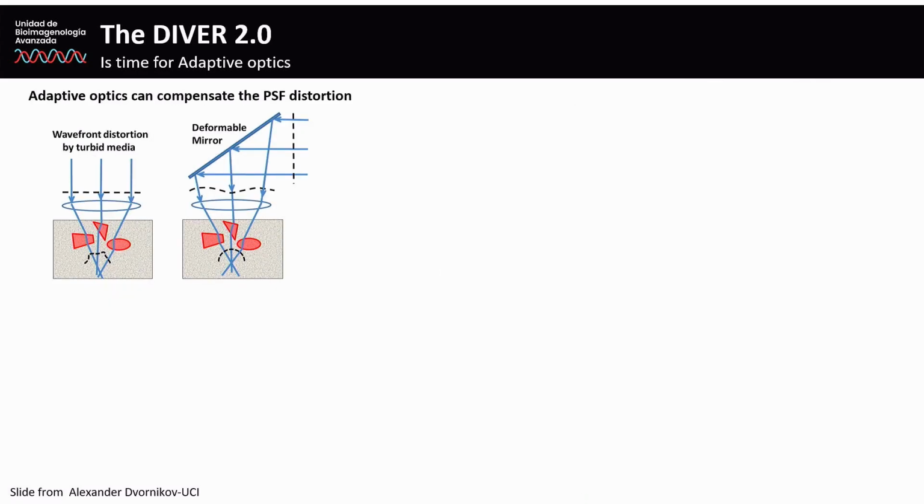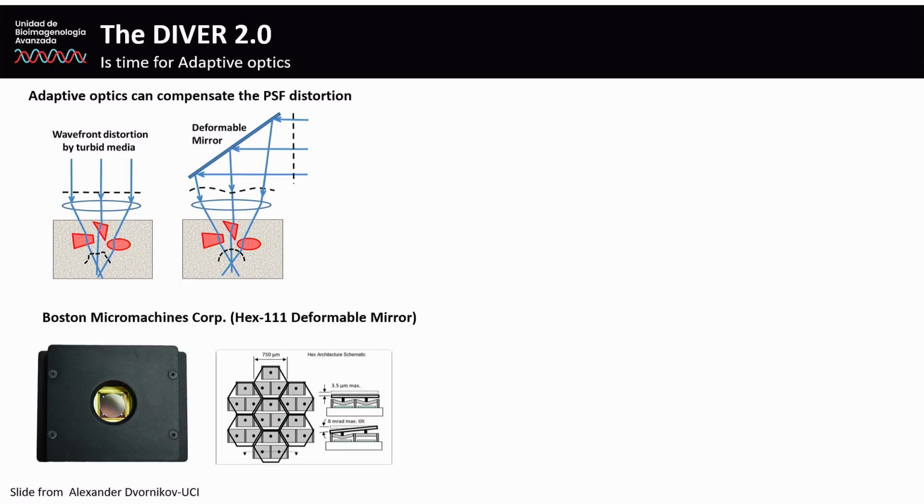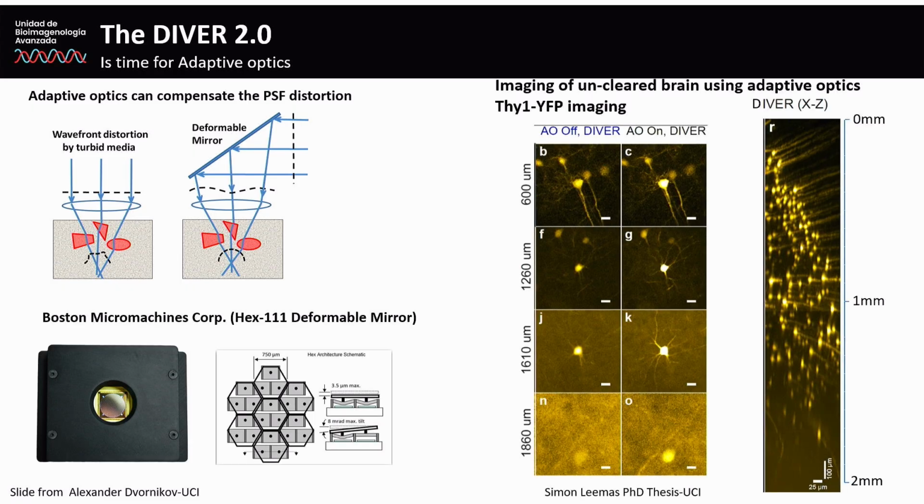The final thing is that the microscope is compatible with adaptive optics, and in Enrico's lab, they also implemented adaptive optics in order to increase even further the capabilities of deep imaging.